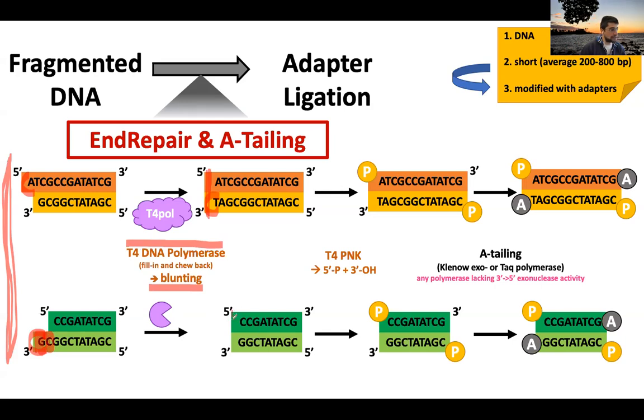Okay, so in this case, you have blunt end DNA, not by addition like it's performed in the top strand, but just by exonuclease function. The result of this enzyme reaction produces blunt ended DNA, doesn't matter how it was at the beginning.